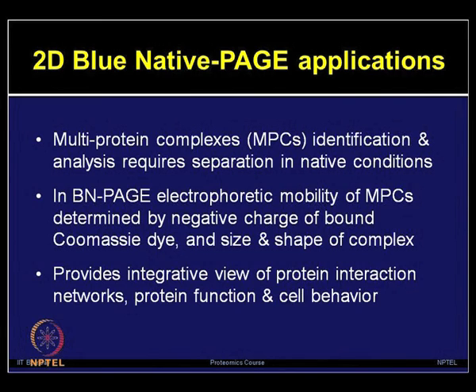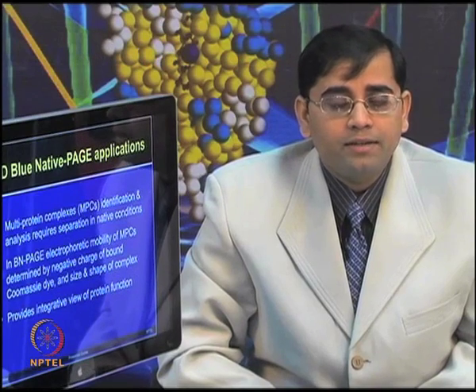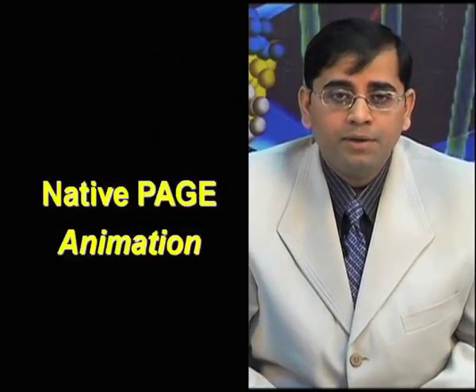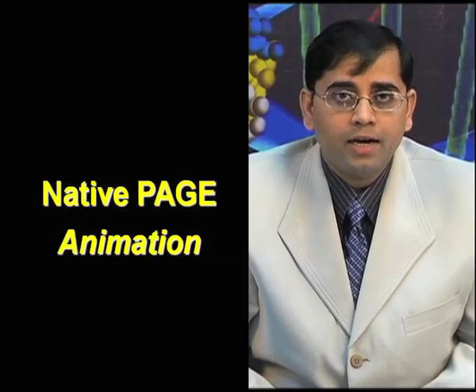In blue native PAGE, the electrophoretic mobility of MPCs, or multi-protein complexes, is determined by the negative charge of the bound Coomassie dye and the size and shape of the complexes. So, this technique can provide an integrated view of protein function. I will now show you an animation of how to perform native polyacrylamide gel electrophoresis.